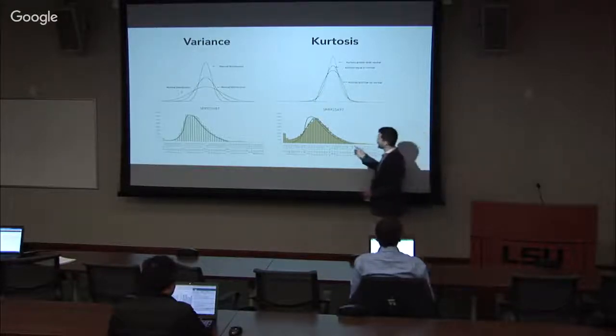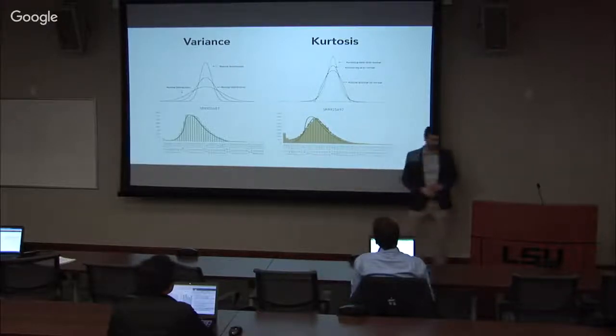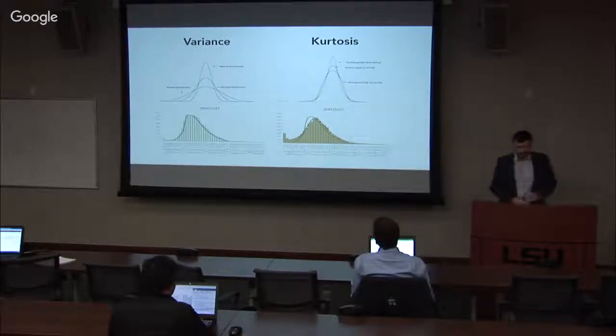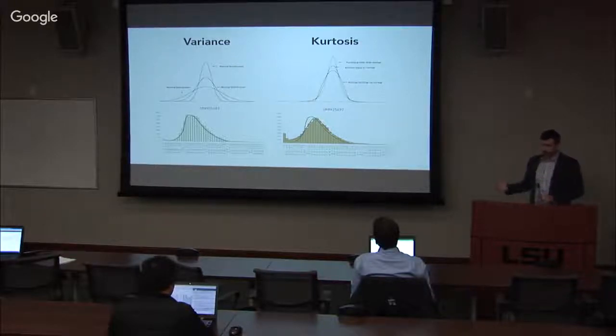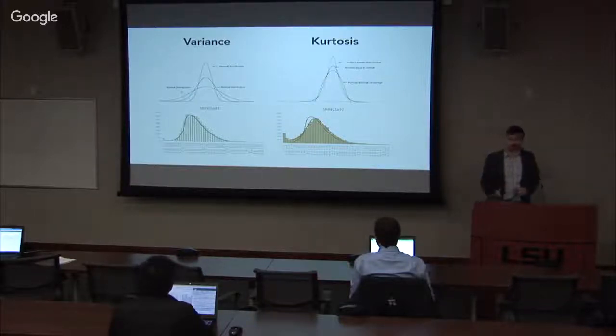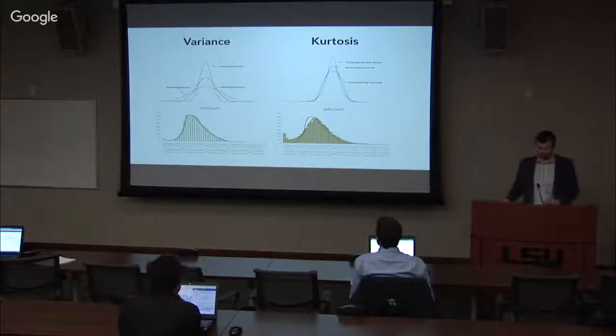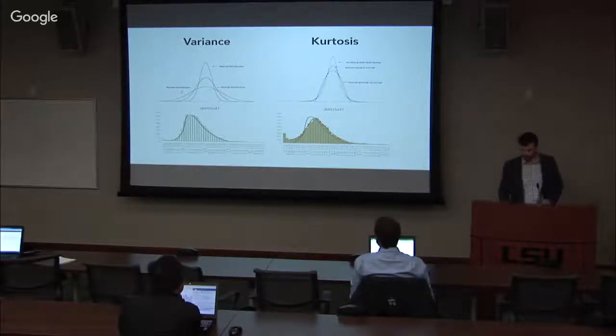And specifically here, what you can notice is that you have this thing coming up here, and it's again in the low values, right? So even for logarithmic scale in your cloud and low samples, you have quite a lot of genes with low expression. And the question is why? Is this something that is biologically meaningful that I'm going to want to pay attention to, or is this something that is not worth my attention and I don't really want to look there?